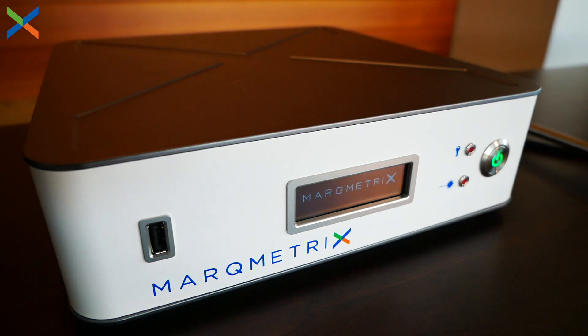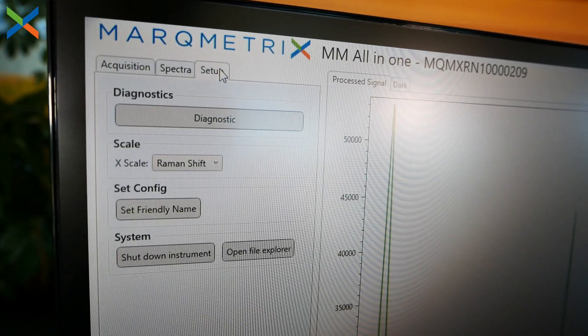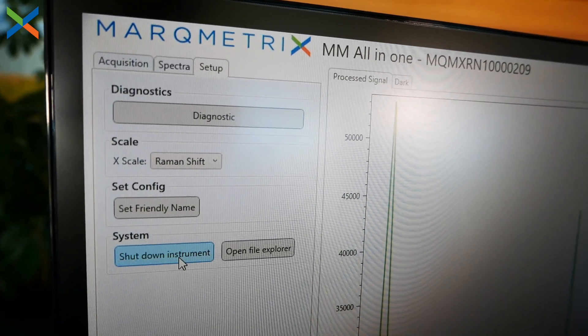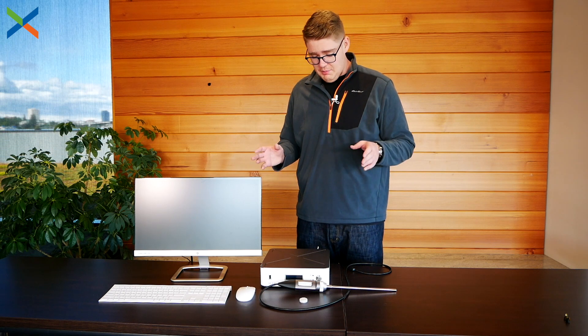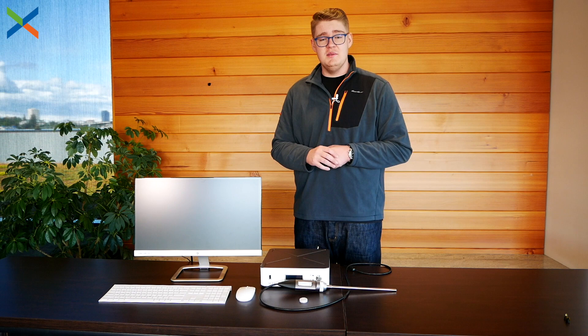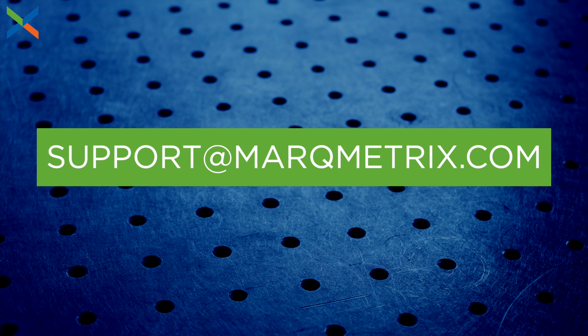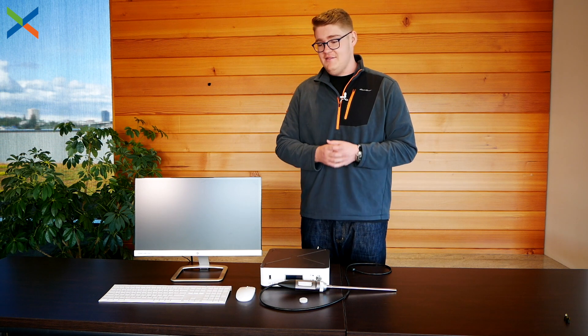When you are ready to power down your MarqMetrix all-in-one Raman system, there are two ways to go about it. You can just press the power button, but we recommend using the software to shut down the system: go to the setup menu, select shutdown instrument, and then confirm that selection in another window. That should be everything you need to know to properly unbox, plug in, and set up your all-in-one Raman system from MarqMetrix. If you have any questions, please send us an email at support@marqmetrix.com. Please be sure to check out our social media pages as well, and thank you so much for watching.